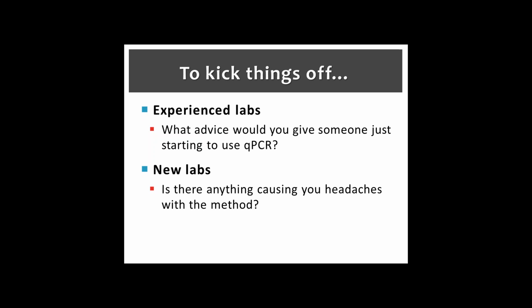But we get the initial stocks of the salmon DNA or the calibrators from Tian, and then we dilute them down to make working stocks so we're not doing this fresh. But how do we take into account that we've diluted it down? Is there a way we have to adjust the numbers when we do our calculations? When you dilute down to the working stocks, you have to make some kind of calculation that you diluted it down in your final calculation.